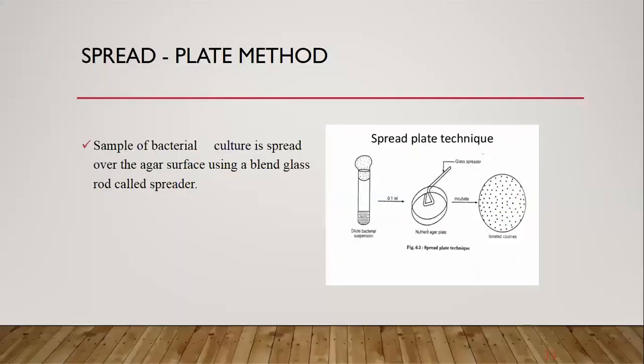We sterilize this glass spreader with the help of pure ethanol. How does it proceed? We dip this glass spreader into the ethanol and apply it to the flame.